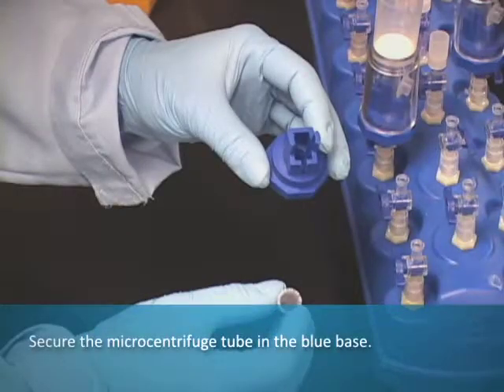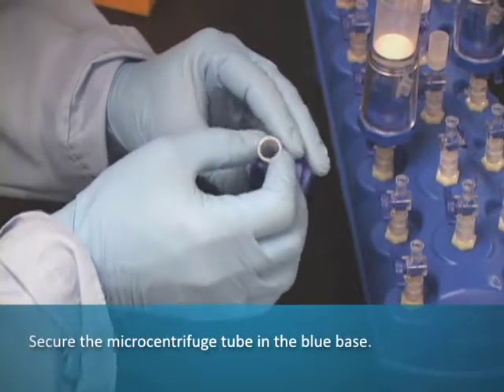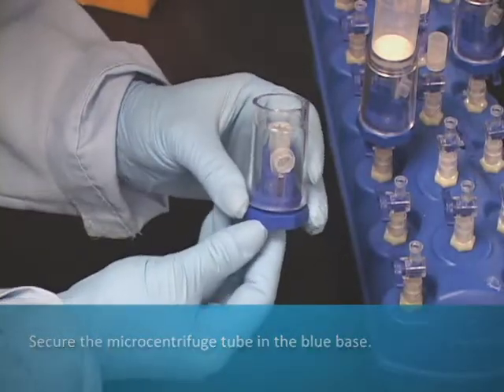Sample is eluted directly from PureYield midi prep or maxi prep columns into a 1.5 milliliter micro centrifuge tube, which is placed in the base. The tube is then secured.